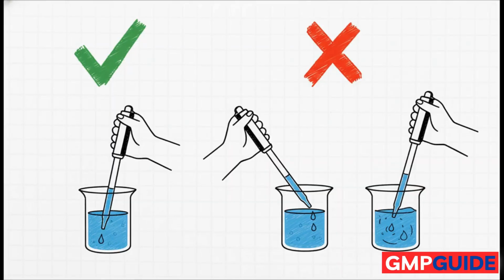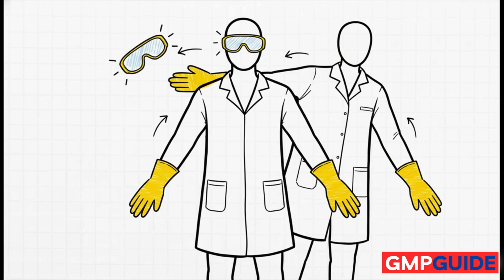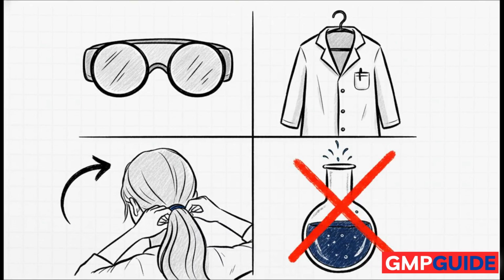Your technique matters too. Always keep your pipette perfectly vertical and just below the surface. And finally, let's talk about the most important part, safety. It's absolutely non-negotiable in a lab. So always wear your safety glasses and a lab coat. And please tie back long hair.